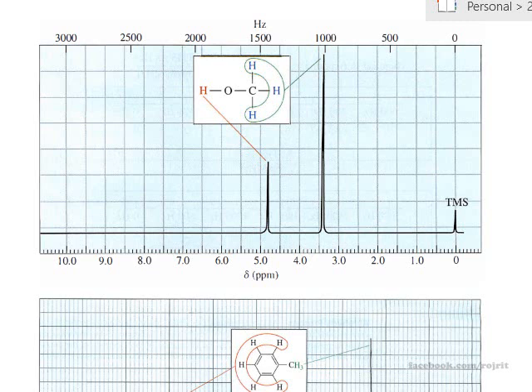So normally, hydrogen on an sp3 carbon appears at about 1 ppm, but because of the effect of the EN value, the oxygen takes electron clouds out from the methyl group and makes your methyl group lack electron clouds. So now the external magnet can fix the hydrogen atom tightly, and you need a higher energy in order to excite it from ground to the excited state. So this is why your hydrogen atom appears at a higher frequency, 3 ppm.